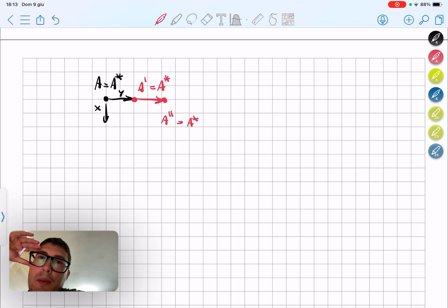So what we are directly measuring is the change of the frequency due to the gradient of the interaction, and therefore it's possible to obtain information on the topography of the sample by measuring directly this delta frequency.